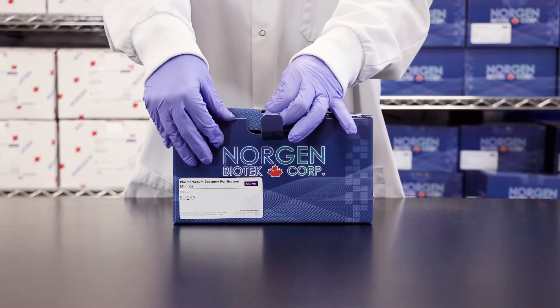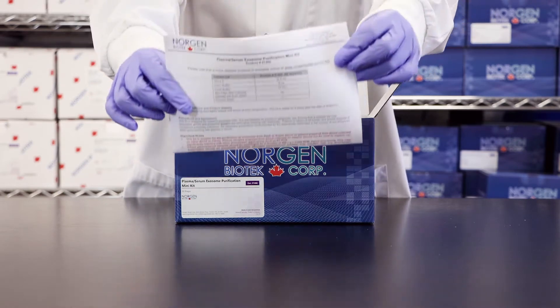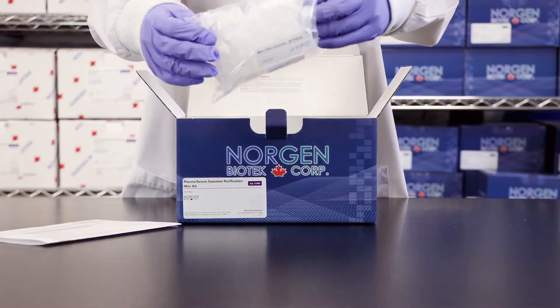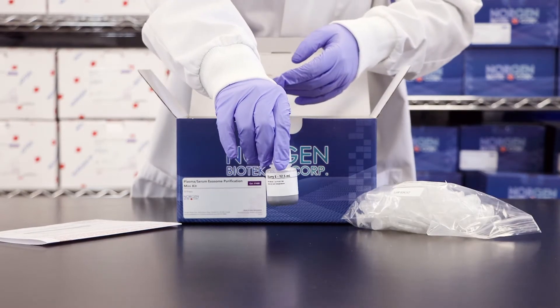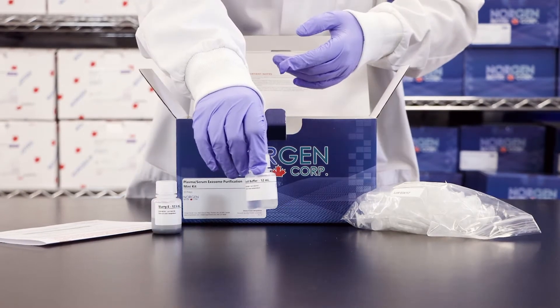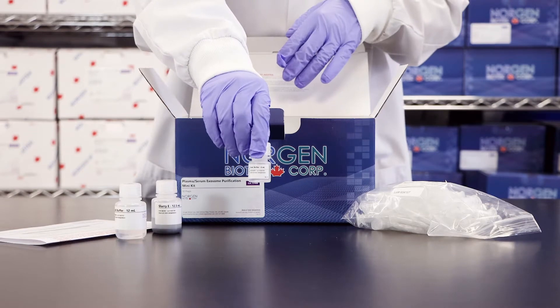This kit includes a detailed product insert, mini filter spin columns, Slurry E, XOR buffer, and XOC buffer.